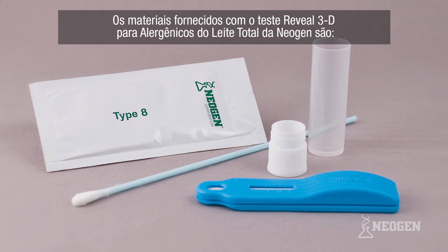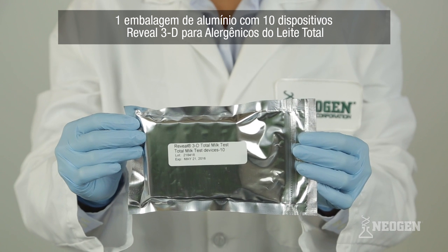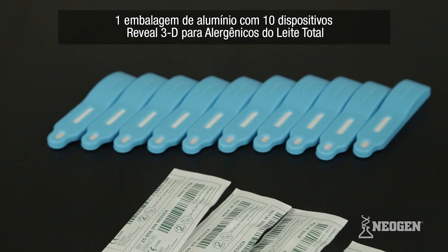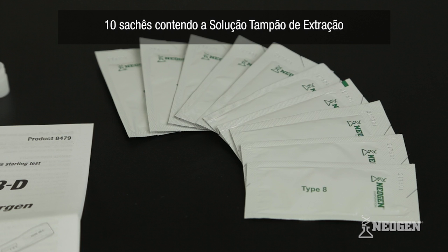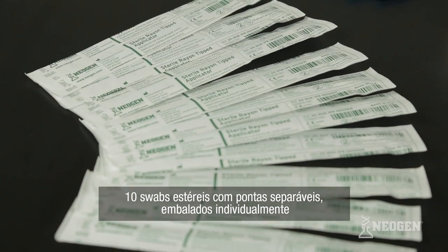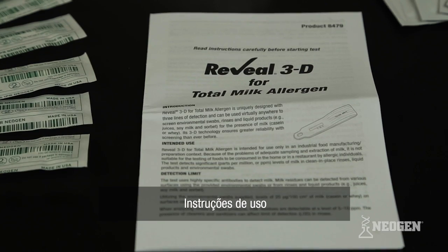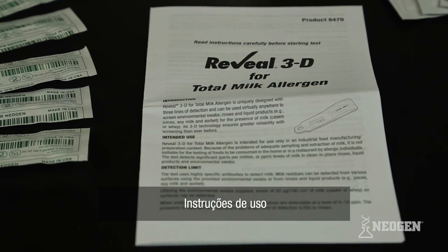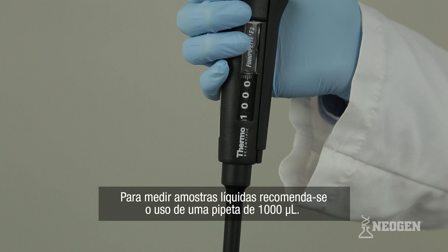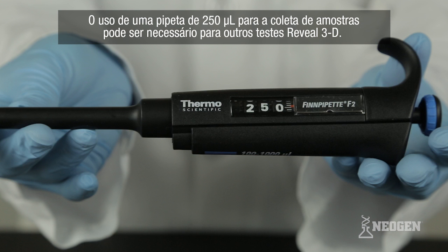The materials provided with Neogen's Reveal 3D for total milk allergen test include one foil pouch containing 10 Reveal 3D for total milk allergen devices, 10 sachets containing extraction buffer, 10 sample tubes and caps, 10 individually packaged sterile swabs with break-off tips, and written test instructions. Additionally, a timer is necessary. A 1000 microliter pipetter is recommended for liquid sample measurement. Other Reveal 3D tests may require a 250 microliter pipetter for sampling.